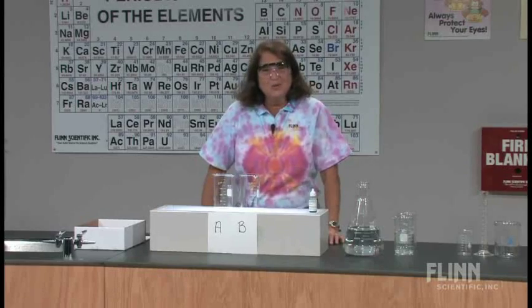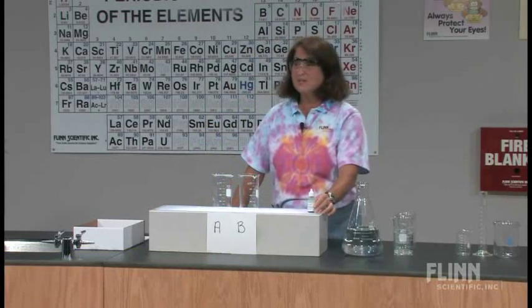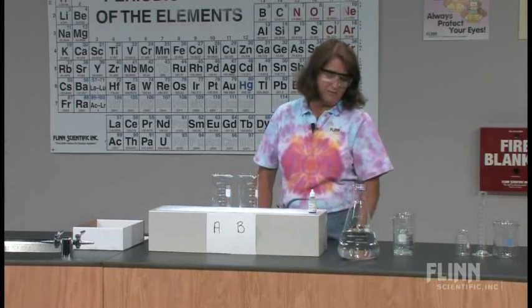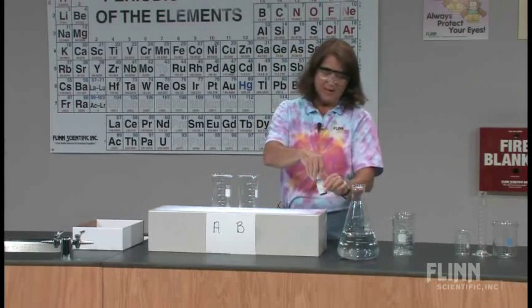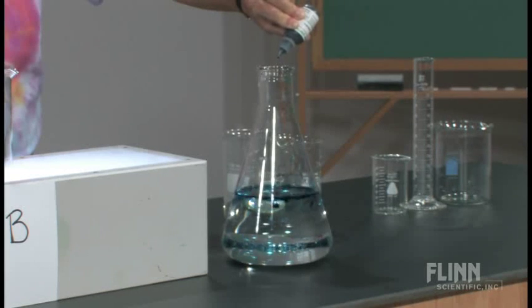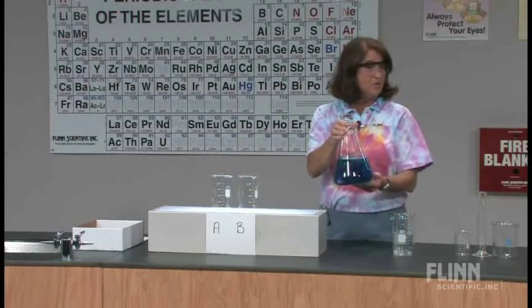What does blue on blue make? We're going to investigate this question by making a solution of a blue food dye. I have an Erlenmeyer container filled with about 1400 milliliters of water. I'm going to put about 10 drops of the blue food dye in, give it a swirl, and I have a homogeneous solution.